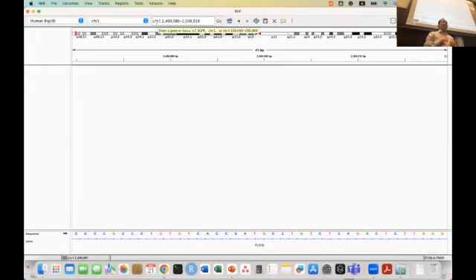Okay. And is there anyone who happens to know how to translate that into bioinformatics language? Padding plus minus 20 bases. So that's the meaning of padding in bioinformatics. To the 5' end we added 20 bases, and to the 3' end region we added another 20 bases. So basically we added plus minus 20 bases of padding. That's what we say here, right?